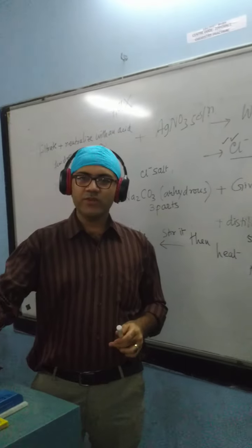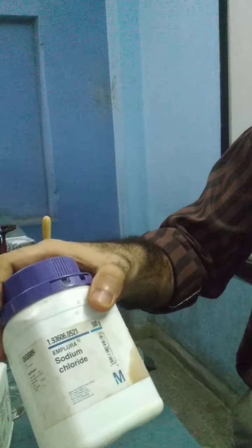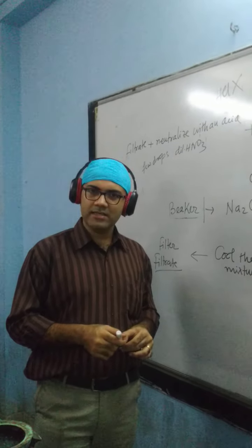With this I have confirmed chloride ion. For your information, the salt which I took was basically none other than sodium chloride. I took a sodium chloride salt, a very commonly available one. Okay, so that's all for the first anion test.